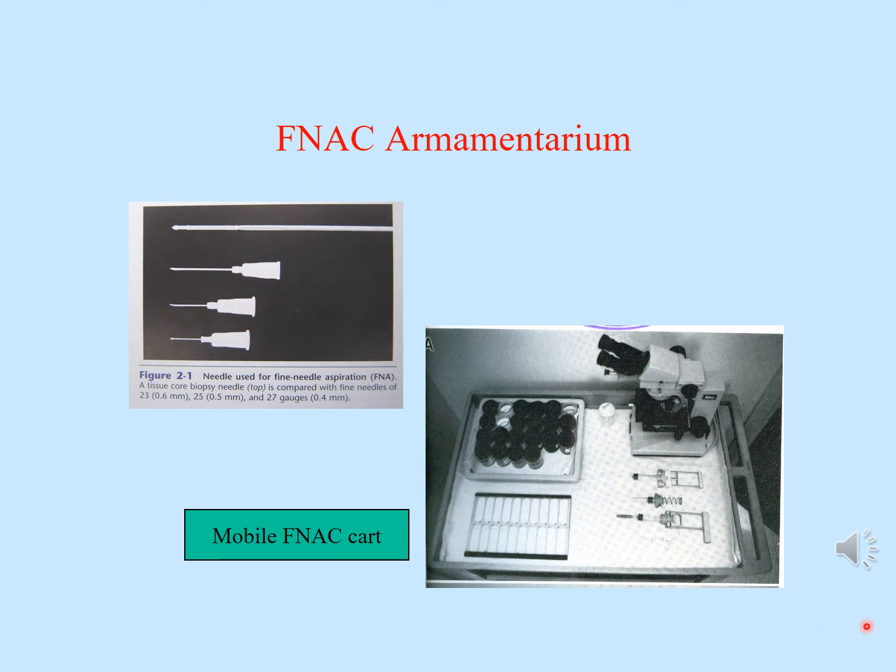All right. In addition to this, what else do we need? So we have a kit like this, wherein you have the syringe, the needle, and the holder here, which comes as a kit. You have the microscope obviously to examine the slide, you have a fixer, you have glass slides, and these are the processing liquids for basically staining the slide.